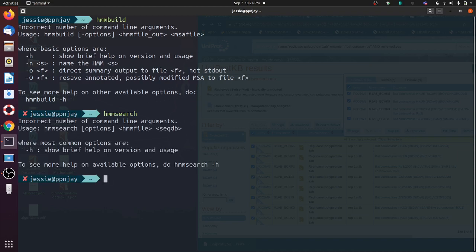I just type in the command, and my shell will now be able to search for hammer, find it, and then run it, because I added the absolute path of where hammer is located, which is inside the bin directory that's inside my software. As I showed you, it has that whole absolute path.